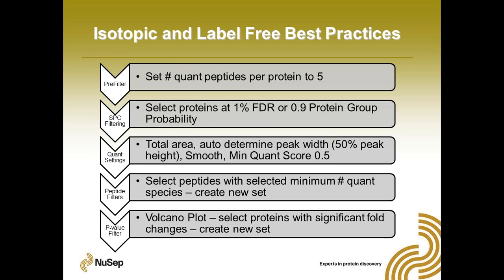The first would be to look at statistically significant quantitative values using the p-value and copying those proteins out to a new list. Then you would go and look at things that were over your fold change to find things that were not only accurately quantified, but that had a big fold change, to find things that were changing the way you'd want them to change.